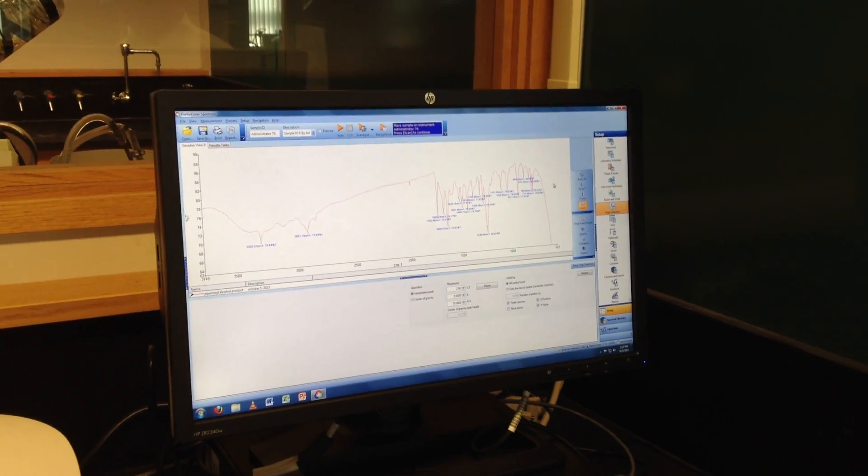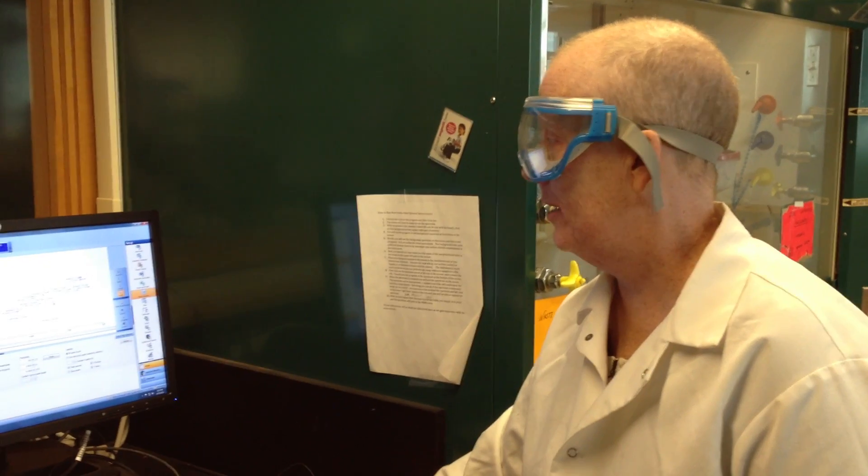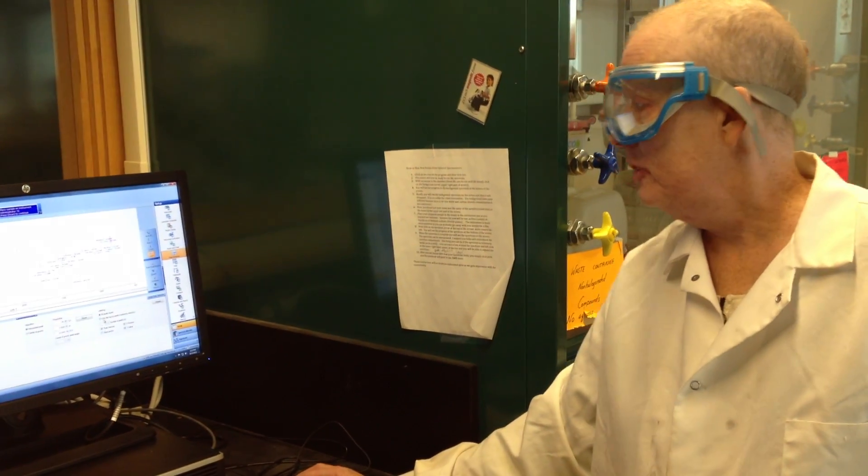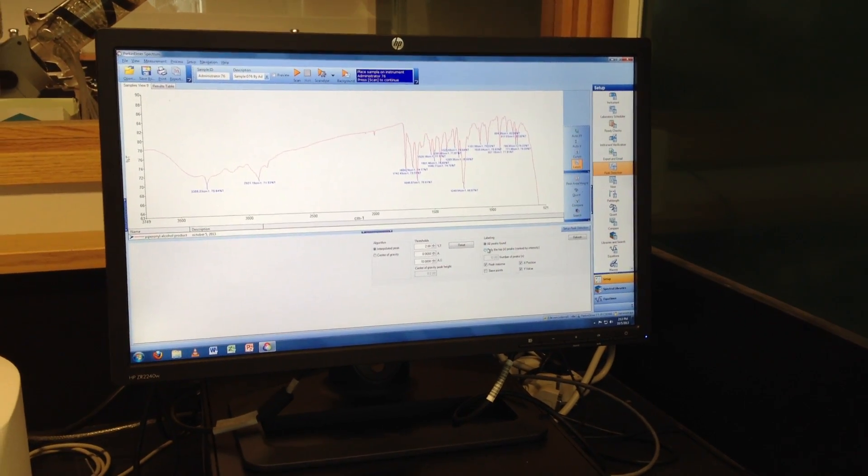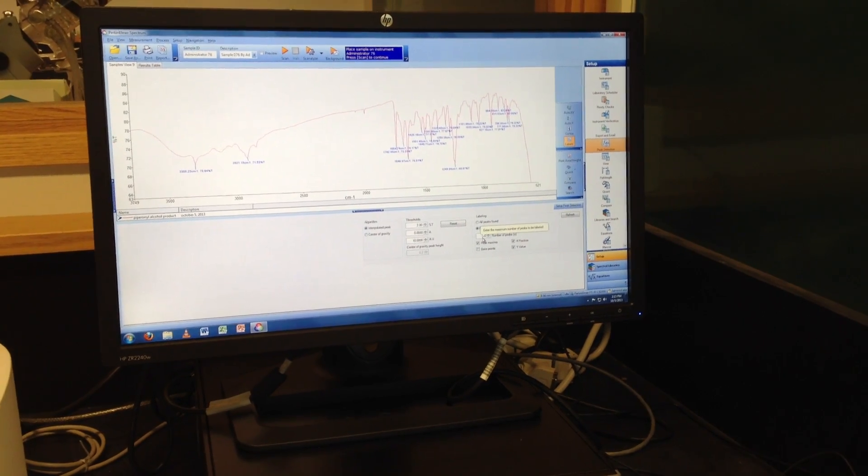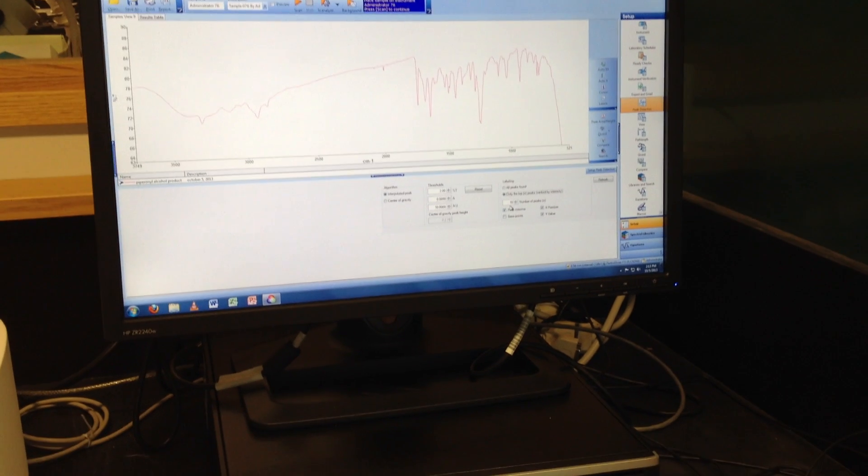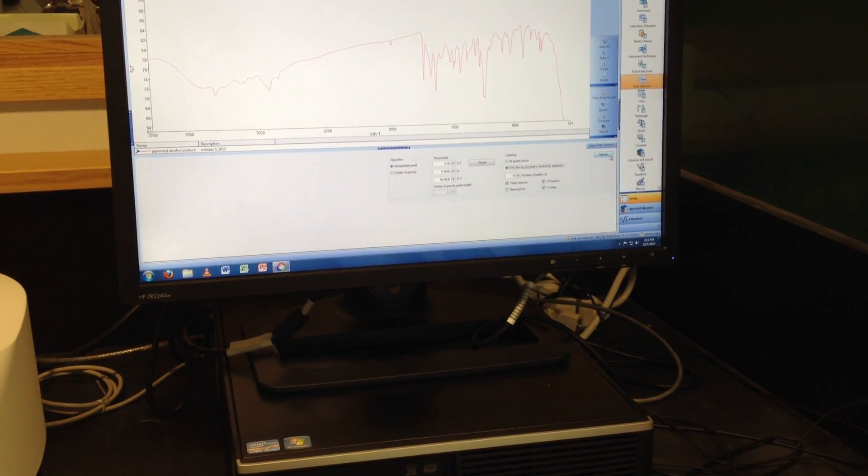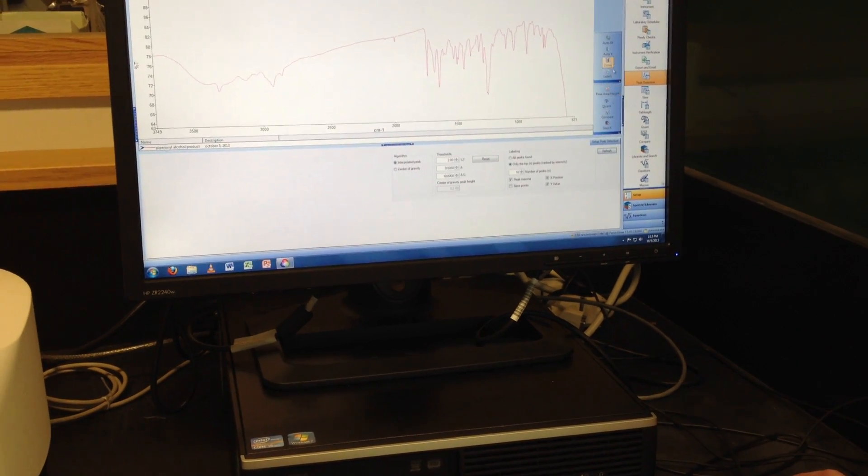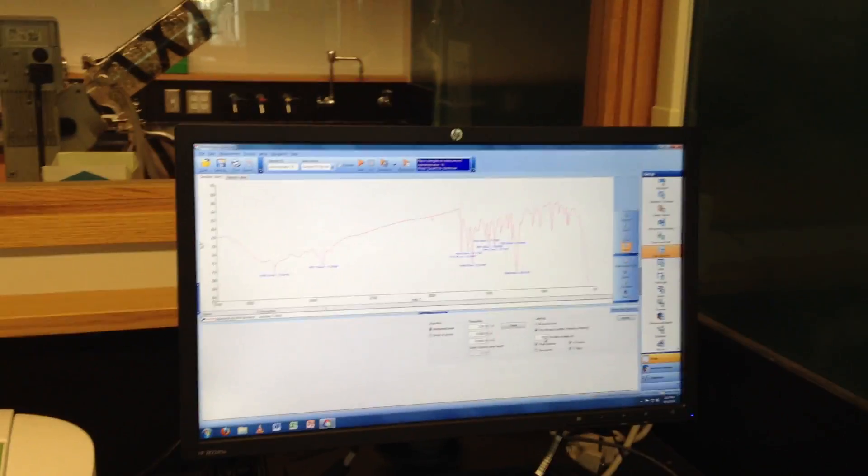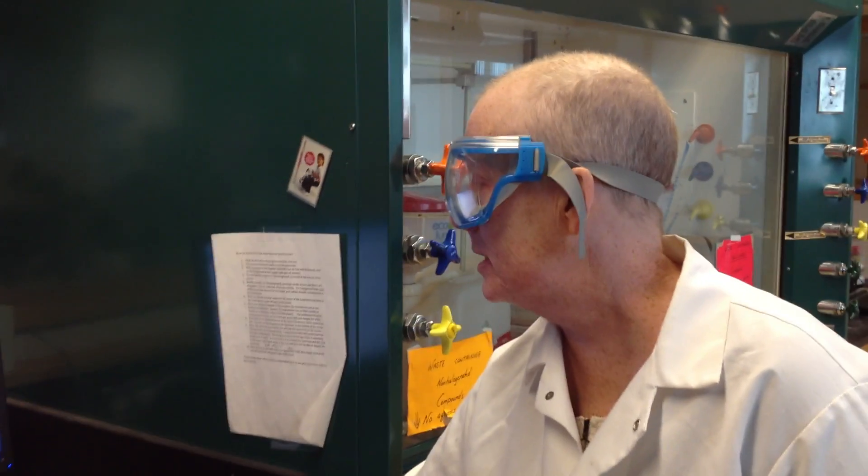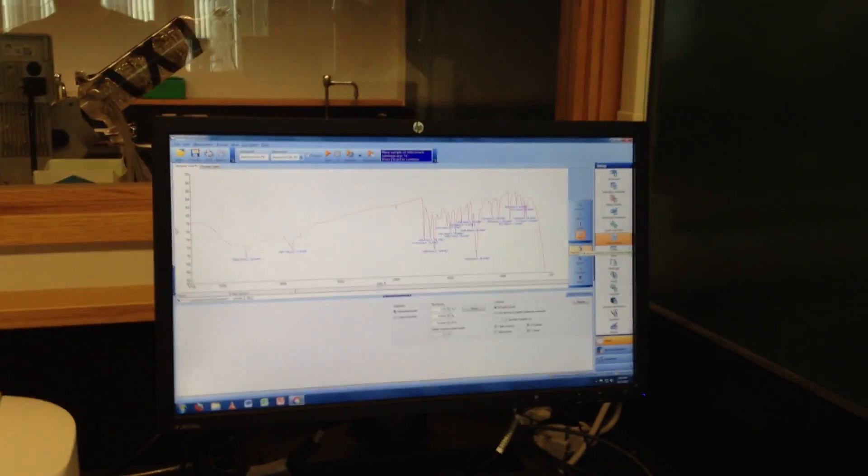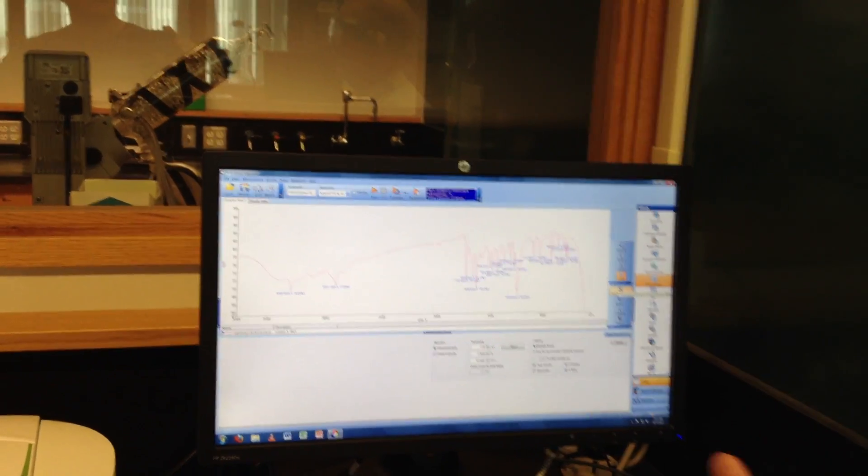There's a lot of detail here. If you think this is too much information, you can change this and say, like, I only want to see the top so many peaks ranked by intensity. So if I click this, I can say I only want to see the top ten. And then I label. So what I did was I switched. I only want the top ten. Now, notice it's only labeling a few things. But you can change that number. You could make it 20 or 30 or 40. The thing is, sometimes when it's all the peaks, it's too much, and they're all on top of each other. But this is actually very nice, and I can read it.